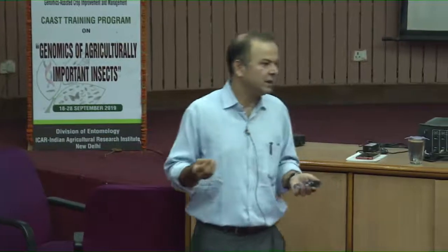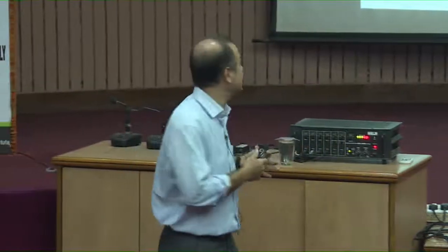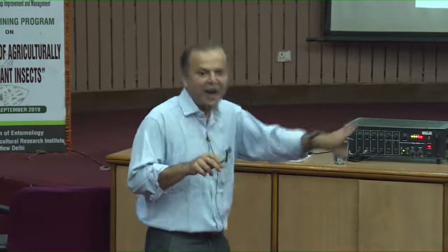The basic is what we do: we take a housekeeping gene with the assumption that it will not show any variation in gene expression. Now we do the same kinetics, whatever we are doing for gene A, we will do for this housekeeping gene also. Then we will compare whatever difference has come in the expression of the housekeeping gene or in the end product of housekeeping genes. We consider that that difference is because of all these factors, because our primary assumption is there is no difference in gene expression of the housekeeping gene. So, whatever difference you get in the kinetics or in the end product of the housekeeping genes in your two samples, you consider it because of all these things. So, the same amount of difference we subtract from the difference that we have got for our target gene. Understand?